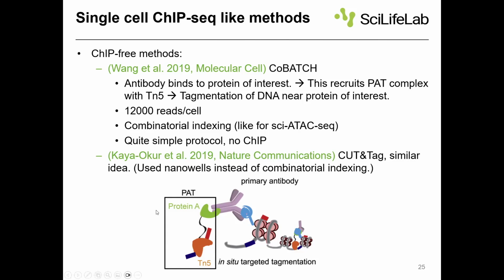And of course, the thing here is that for every protein you want to study, you need a different antibody. And so it sort of becomes its own experiment. For every antibody, you have to test that this antibody really works. For some things that a lot of people study, like histones and histone modifications, there are well-tested antibodies that you know work. But if you have some very exotic transcription factor that nobody has ever looked at, then it's harder. Then you have to come up with the antibody and validate it yourself, and it's a bit more work.